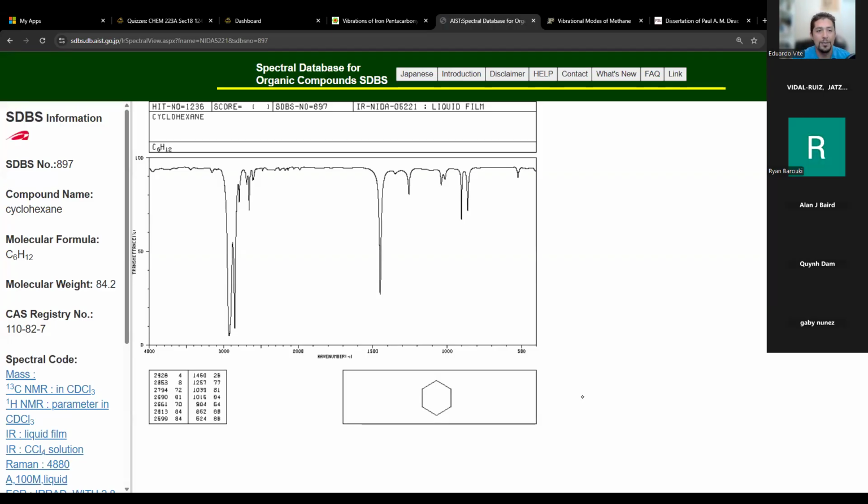Now, maybe someone might get excited and say, oh, look at this one. That looks like a carbonyl. Well, is there a carbonyl in the actual structure that is given to you? Do you see a carbon double bonded oxygen in there? You don't. So why would you say there's a carbonyl when you don't even have it in your structure? This is surprisingly a very common mistake. I see this a lot. I think people kind of panic and start guessing, oh, carbonyl, carbonyl. Like you start saying carbonyl for everything.